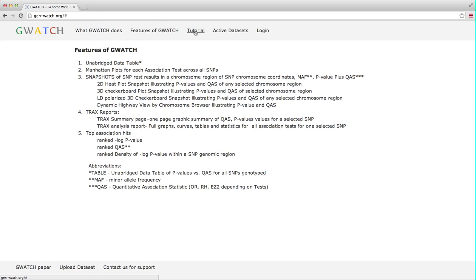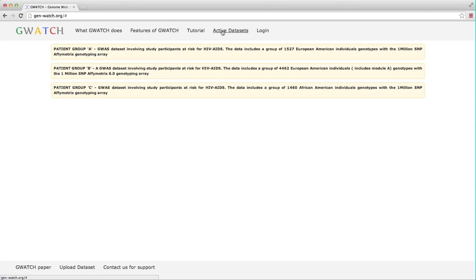There is a tutorial section, which is what you are viewing right now. Active dataset section is the heart of GWATCH. This portal contains the chromosome highway browser, search tools and all the useful stuff GWATCH was built for based upon the open access datasets that users have uploaded and released into GWATCH.